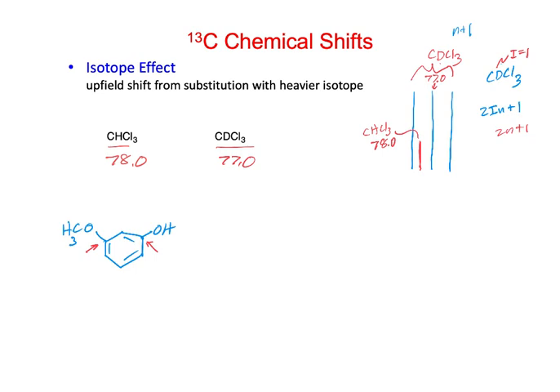So if you esterify the alcohol, if you treat it with a common one would be just acetic anhydride and pyridine or triethylamine or something like that, then you could make an ester out of the alcohol like this, and we'd see quite a downfield shift here. This one would be less changed, and so we could assign which one was which.